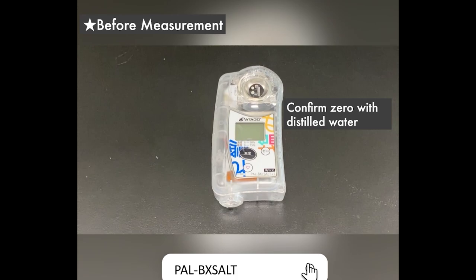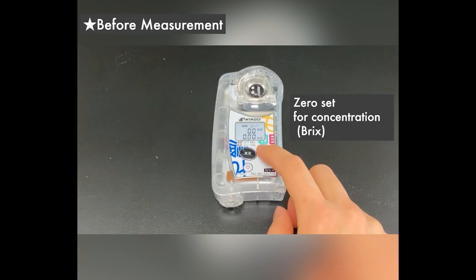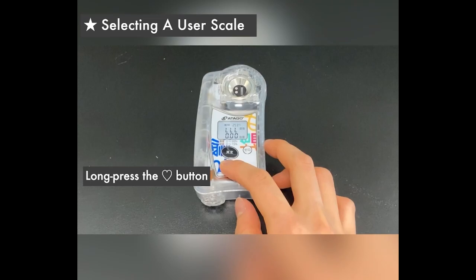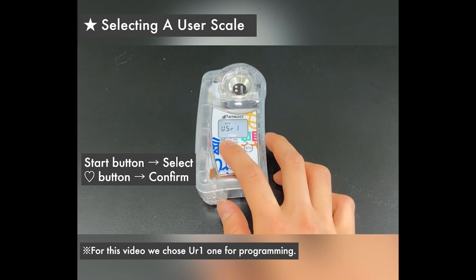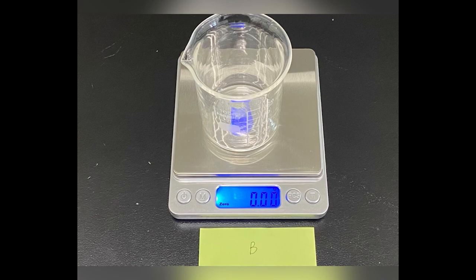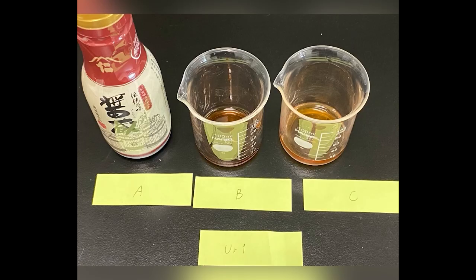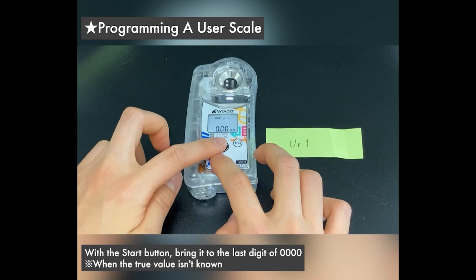Let's check out how to set up the user scales with an official Atago video. Start by zeroing out the unit with distilled water. Now let's enter in our own user scale. We'll need to prepare three types of liquid: the original pure sample, one diluted about ten times, and one diluted about five times.